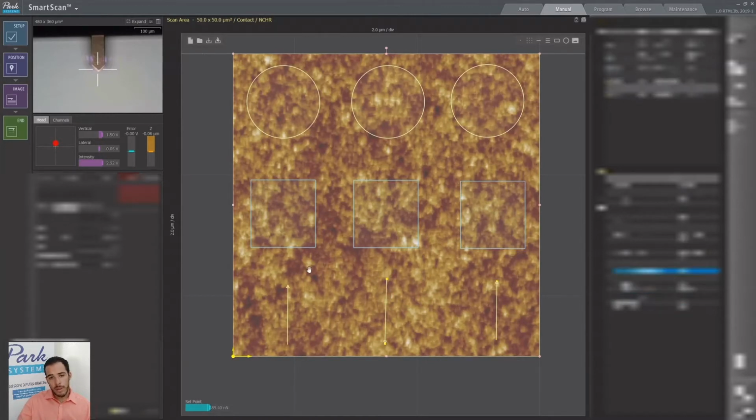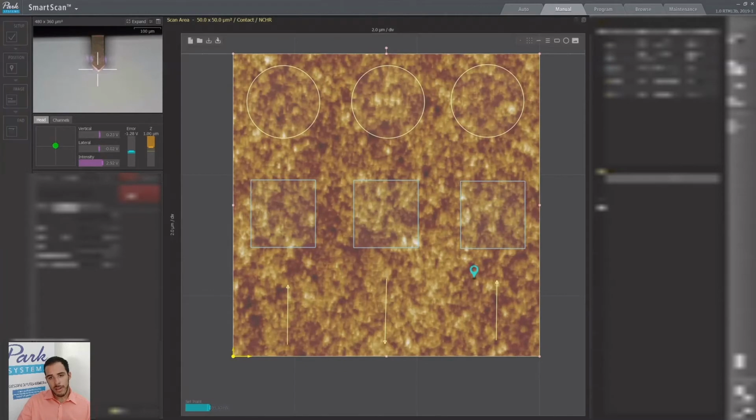Once we are done with adjusting this setting, you have to click Start, and the lithography process will start automatically. We can see that it just takes a couple of seconds to actually finish the lithography process. If we look at the upper right corner of the screen, we'll see that there's another panel called Object List. This object list will give us an estimated time of how long our lithography process will take for each feature.